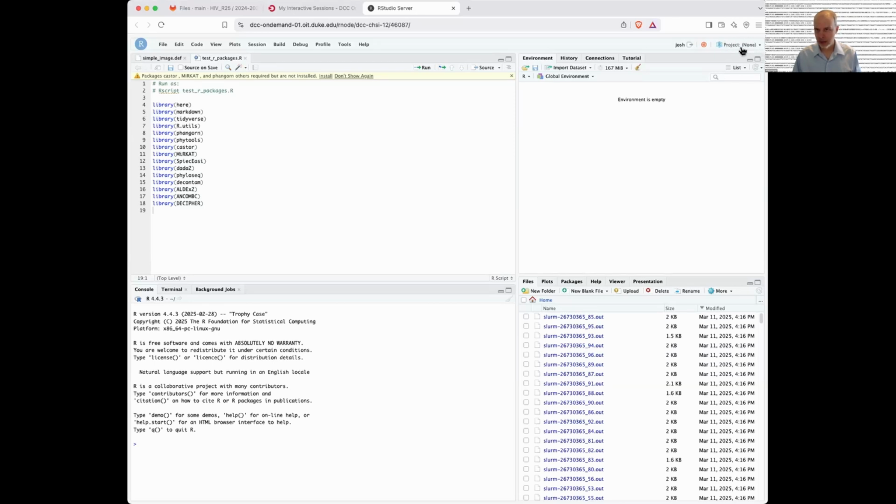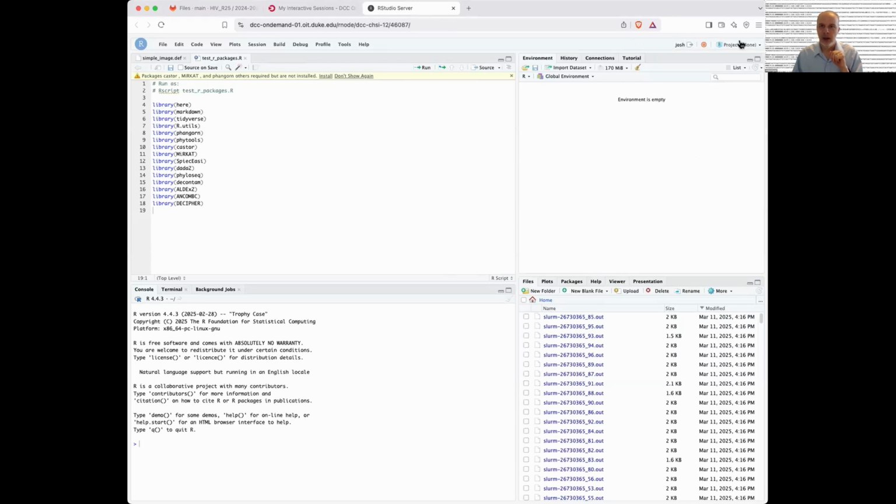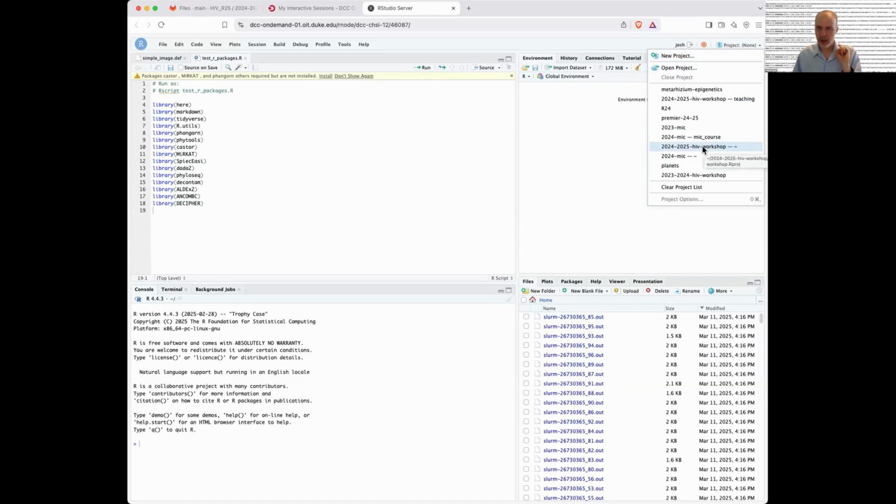If it says none, that's fine. If it says 2024, 2025 HIV workshop, you're good. Right now mine says none. So if yours says none, you want to click here on project and find the 2024, 2025 HIV workshop, and I'm going to click on that.